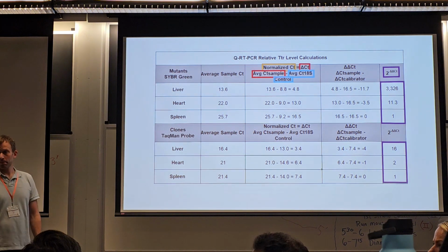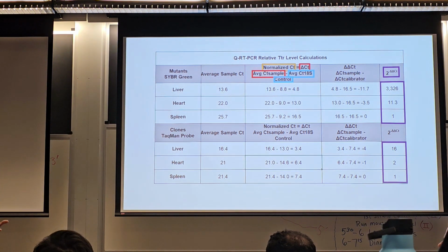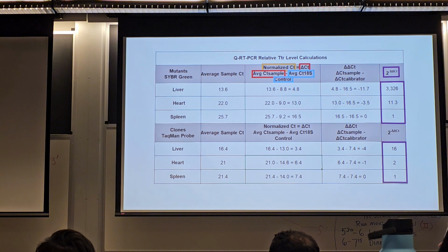Is the TaqMan assay technique more reliable? TaqMan is more reliable in terms of its chemistry, in terms of minimizing off-target amplification, but I don't want to say more reliable, because if you have a well-optimized SYBR Green assay, it works beautifully. You just have to understand that you have to watch out for primer dimer and off-target amplification, and run your melt curves and make sure you get that nice peak where you think you should have it. If all that falls into place, there's no problem with SYBR. SYBR works fine, it's just that there's more to consider and more to work out to have a SYBR assay that you can be confident in the results of.